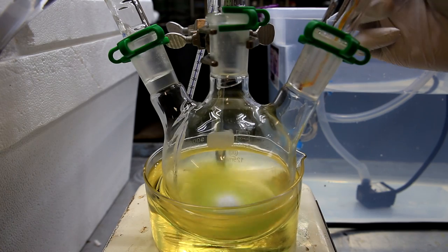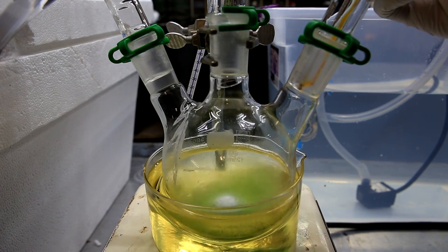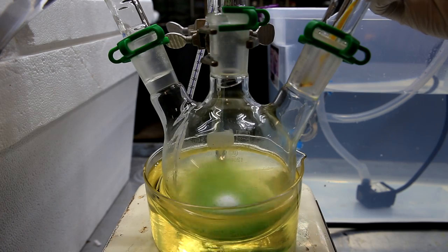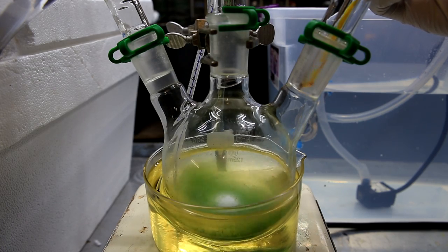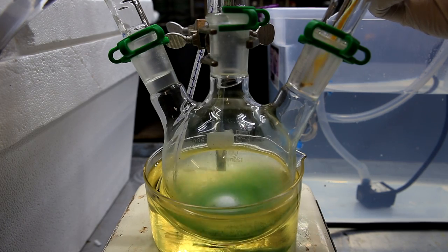The color indicates that the chromium is going from an oxidation state of plus six, which is orange, to an oxidation state of plus three, which is green. This means that it received three electrons from the n-propanol, thereby oxidizing it.